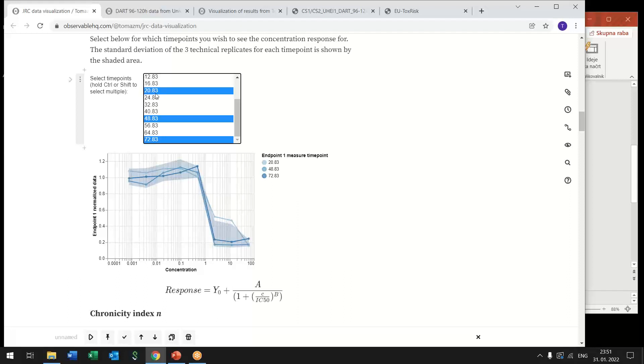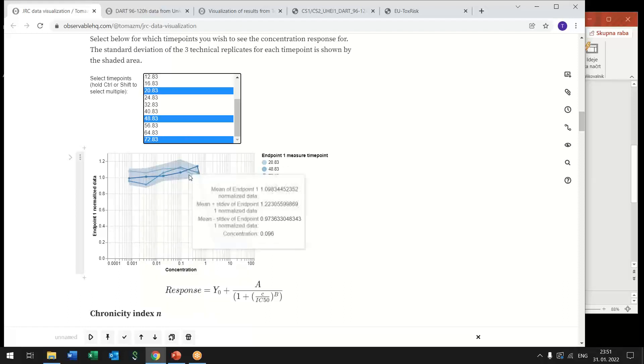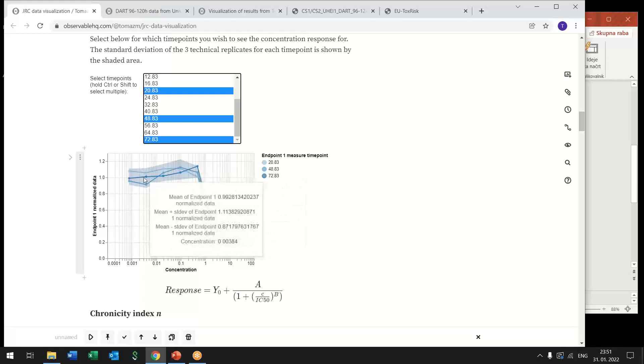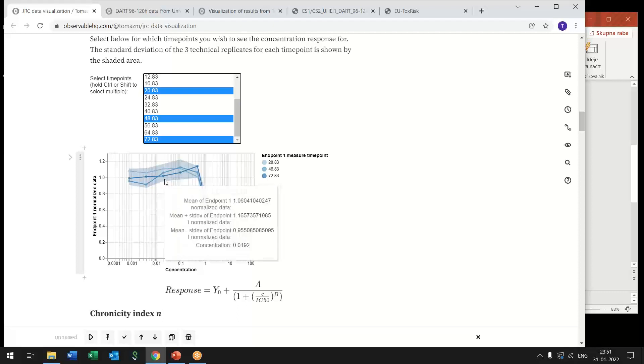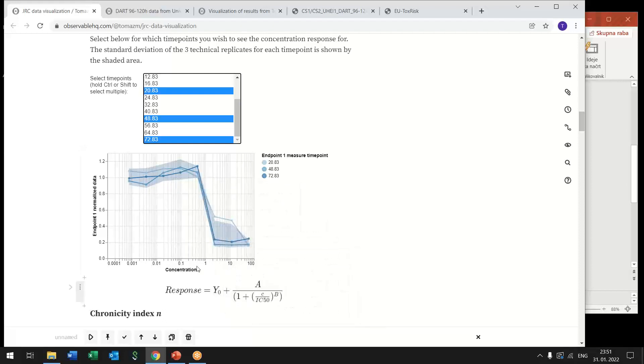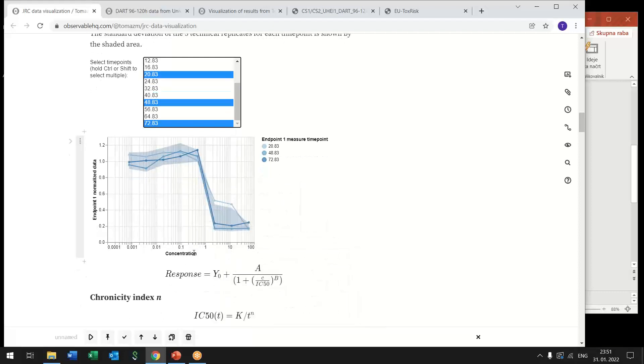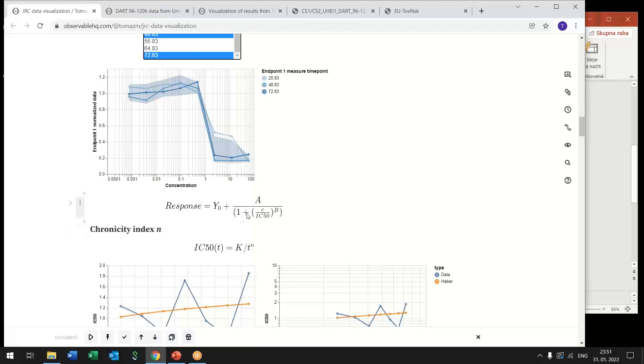So with this we see that this cytotoxicity versus concentration has this typical sigmoidal response that can be fitted with Hill function and from this expression we can extract IC50 values.